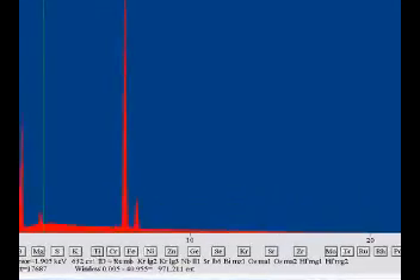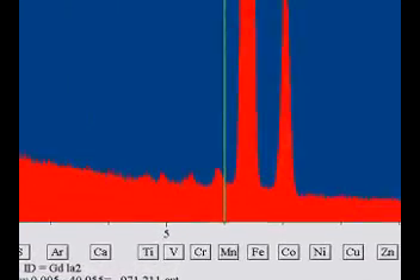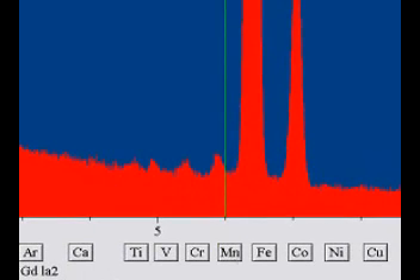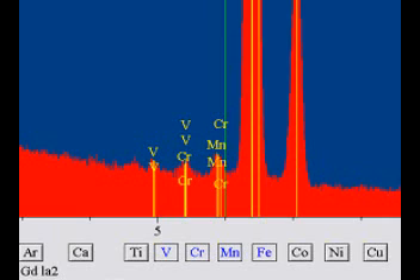Here's the EDS spectrum — this is what the E-beam can do. Notice the three little peaks to the left of the iron peak: there's your manganese, chromium, and vanadium — barely visible out of the background, and almost no nickel and copper visible.